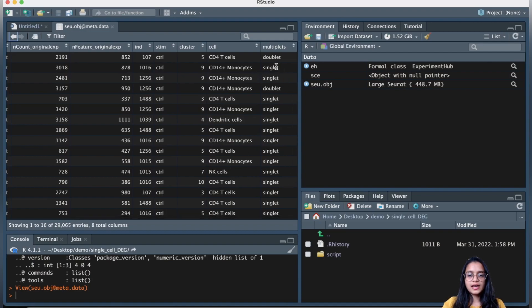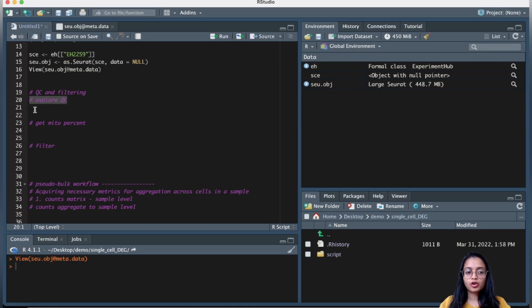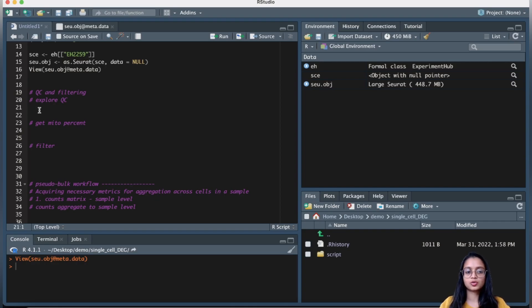It also appears this dataset has been run through a doublet finder algorithm, because certain cells are predicted as doublets and others as singlets. We essentially want to filter out the doublets in our filtering steps. For QC and filtering, I encourage you to explore and visualize your data and come up with thresholds to filter your cells. If you're unsure how to do that, check my earlier video on analyzing single-cell RNA-seq data using the Seurat workflow.